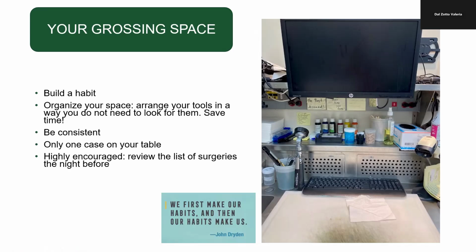You are not going to run or walk to another area to look for gloves or for ink that you don't have, because this is going to be time consuming. You are going to spend time organizing yourself, and we need you to be time efficient. And you will see why, because you will have a lot to work with. So efficiency is key.